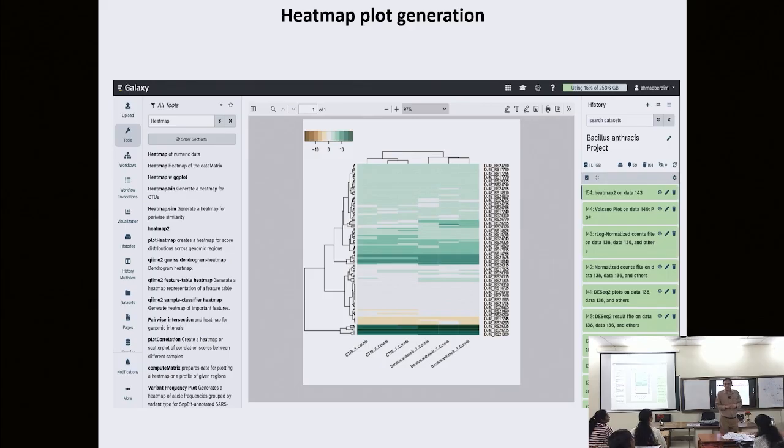Okay. So once you have the gene network, then you can start mapping the differentially expressing genes that you have obtained from your experiment for this particular strain onto this network, and then identify the modules that have an enrichment of differentially expressing genes.